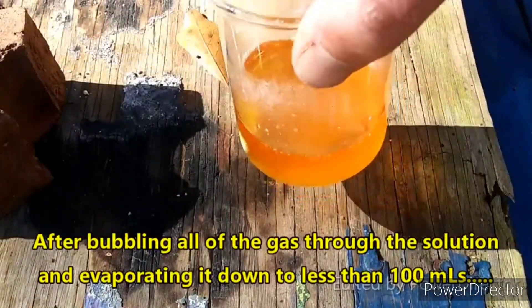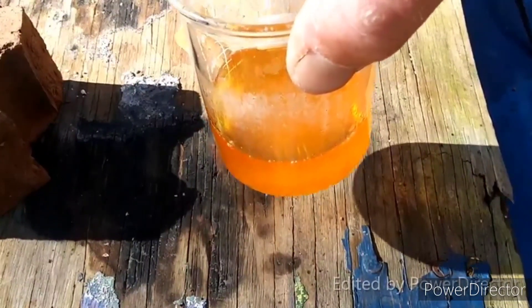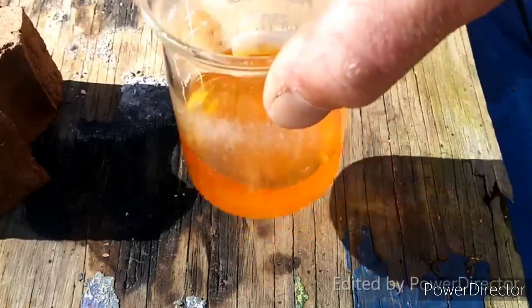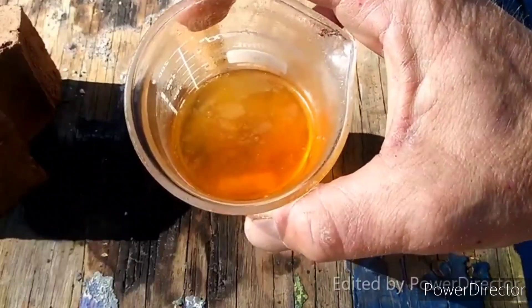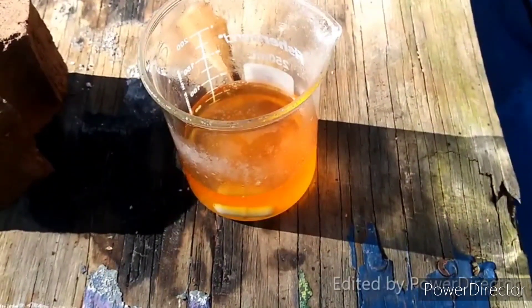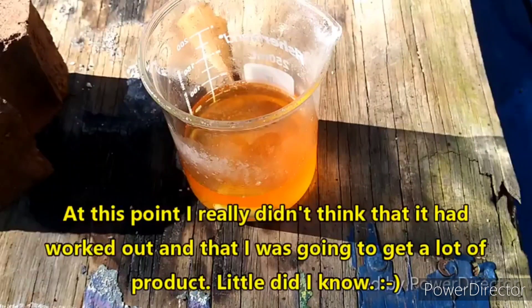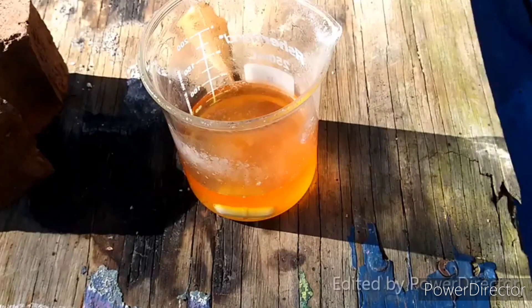This urine-after-a-night-out-at-the-bar looking solution is what I've got after evaporating down the sodium sulfide solution. I presume there is some excess sodium hydroxide in it which has probably done a number on my beaker. The sodium sulfide is just now starting to crystallize out. I've removed it from the heat and I'm going to allow it to crystallize. I'm very encouraged — I very much doubt this is sodium hydroxide, which I think would still be completely soluble at this volume. The yellow color is either sulfur or polysulfides, more likely polysulfides. Hopefully we end up with a nice clear product.